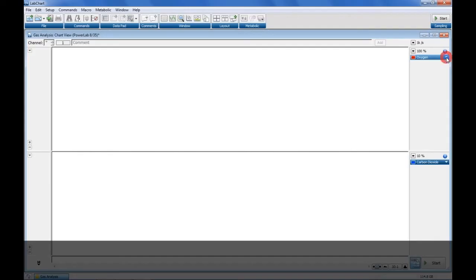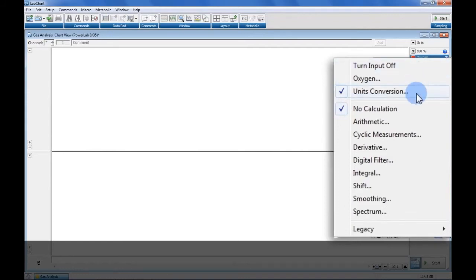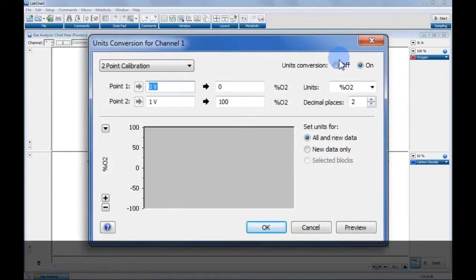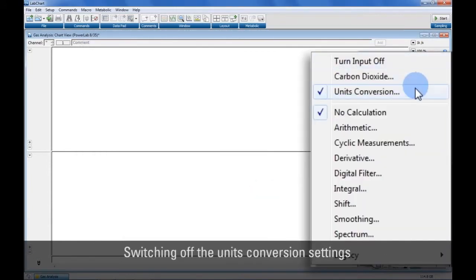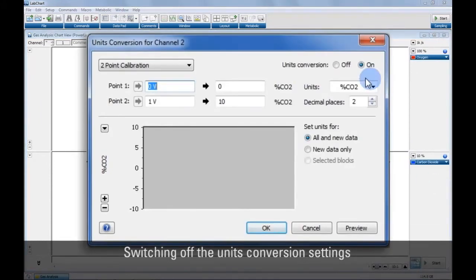Calibrating with LabChart. Use the unit's conversion feature to perform an independent calibration of each of the CO2 and O2 transducers in LabChart. Start by switching off the unit's conversion settings.